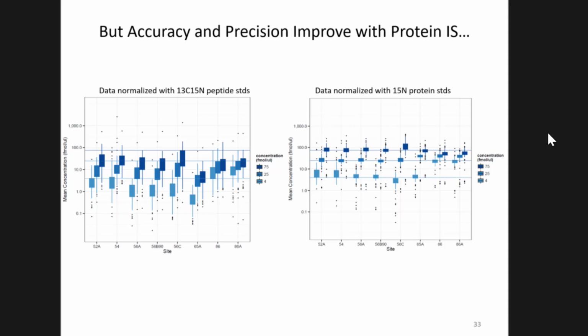Yes? Question. So you always use the same peptides for quantitation, whether you do protein standard or peptide standard, right? Yes. So you don't discover any new peptides in the protein standard? No. We digested the proteins and could have added in more, but likely they would have been missed cleavage products that showed up.